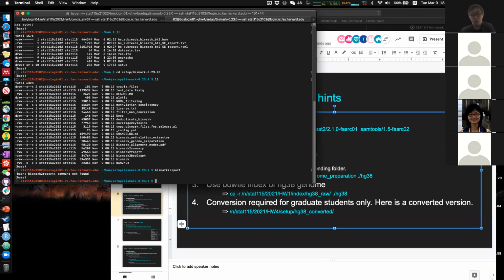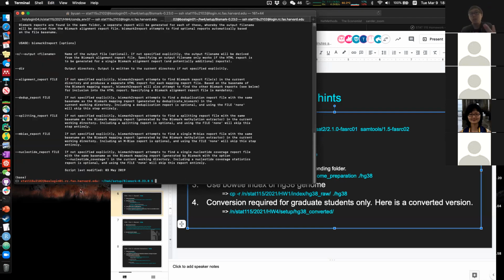So in order to run this, there are multiple ways, and the two ways I would recommend are, one, to use Perl here. It's just like what we do with R or with Python. We put the language first, then put the script, and that would give you the command and all the help you would need.